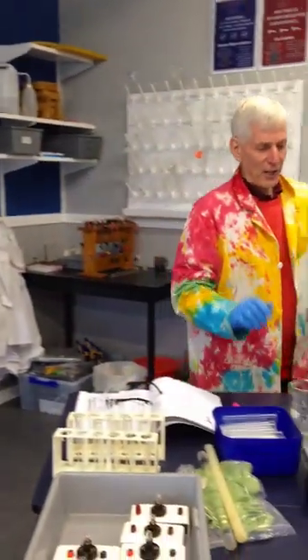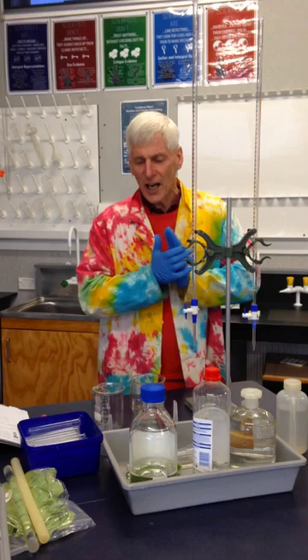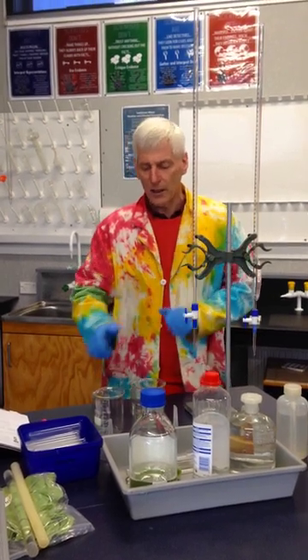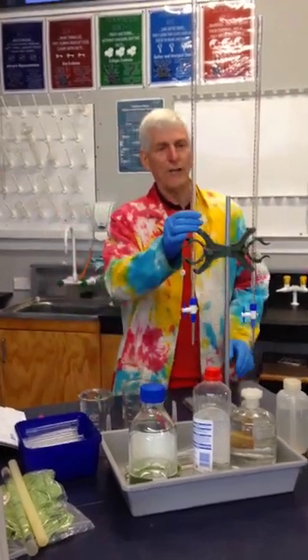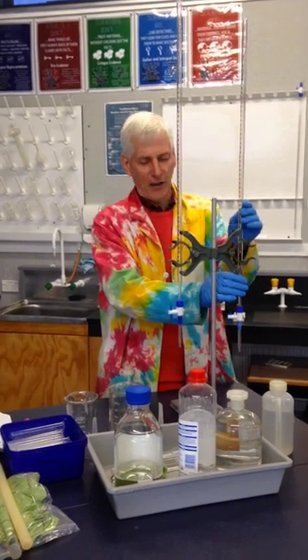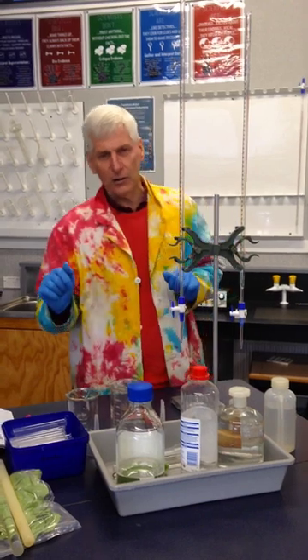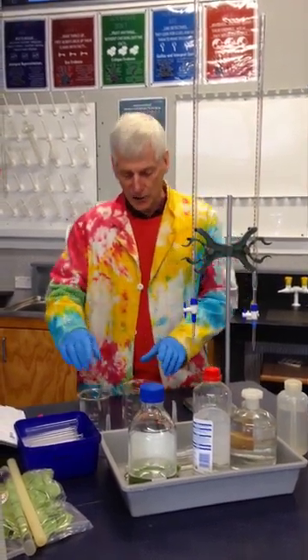The first demonstration is this one here, where you can test for polar, non-polar substances. And we're going to just take water and put it in one of these burettes, and hexane and put it in the other, and they both respond differently to electrical or electrostatic charges.